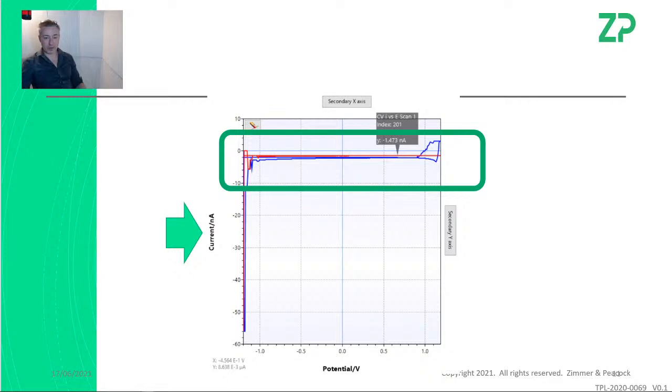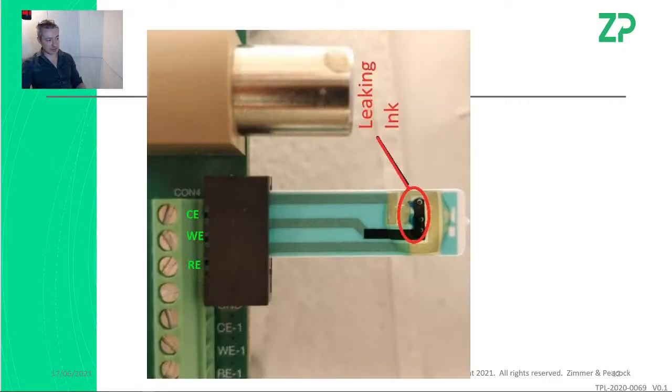Now when we look at a photograph that they kindly sent us, what you notice is that they've actually got ink spreading. They've also got little bubbles on here. So what this tells me is there's an awful lot of voltage being applied but nothing going on. And the reason is this: the counter electrode, working electrode, reference electrode, let me just bring in those 3 arrows again.